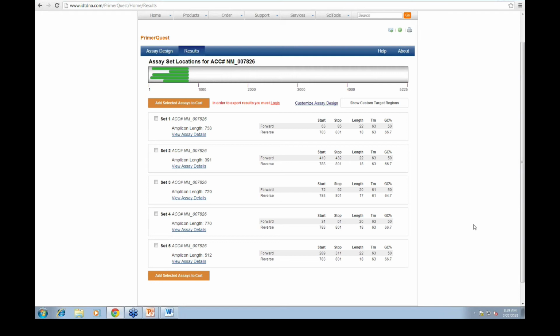Unfortunately, there's not a really good way for our tools to locate those. It's pretty hard for them to find the SNP location. So typically we do a lot of those designs manually in-house. One thing that you can do is if you do know those SNP locations, you can simply design it in the way that I mentioned. But unfortunately, there's not a design tool that can kind of think through that process. So we can just give them some contact information. They can contact the customer care people at the end.